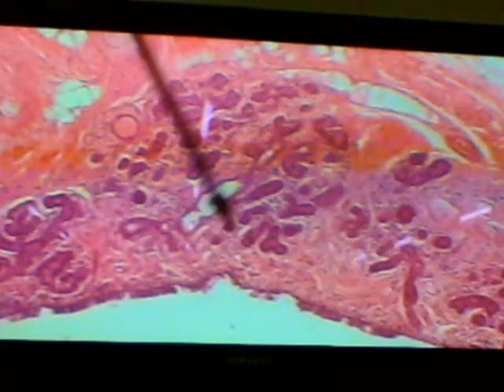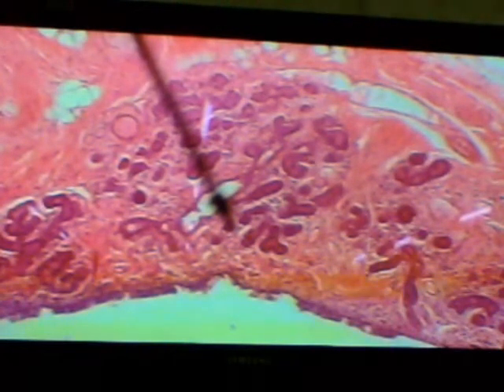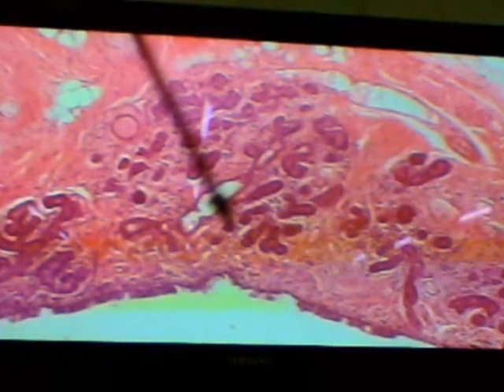They're at a higher level. The meibomian glands go right down towards the tip of the eyelid, but these glands are higher up. They are more towards the fornix. And these are the glands of Wolfring. And these produce a serous secretion. Let's look at them on the higher side.